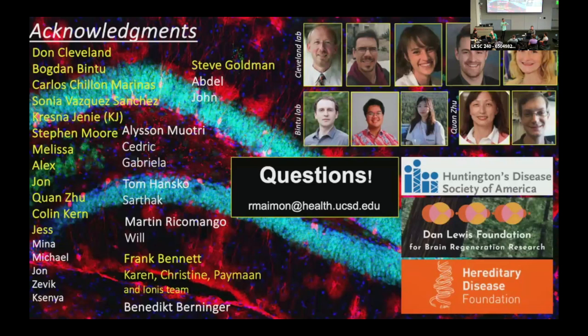So then we went up to 200 hybridization rounds, and Sonia also developed protein stainings and DNA staining, and it's working pretty well. So this is where it came from. We also improved the cell segmentation and Merlin. When I say we, it's mostly Bogdan Bintu. I'm just a little pawn. So this is what we think is giving us the more sensitivity and stability.